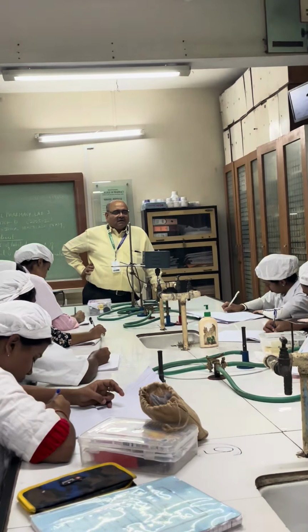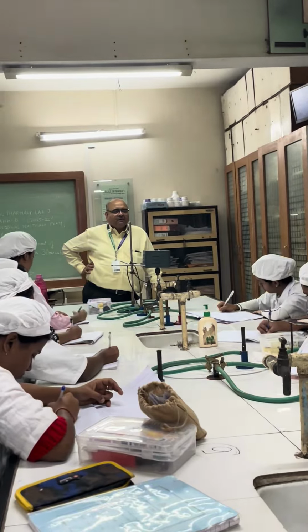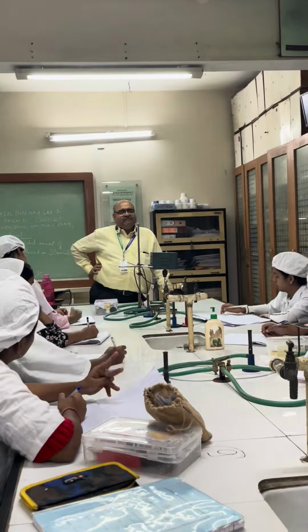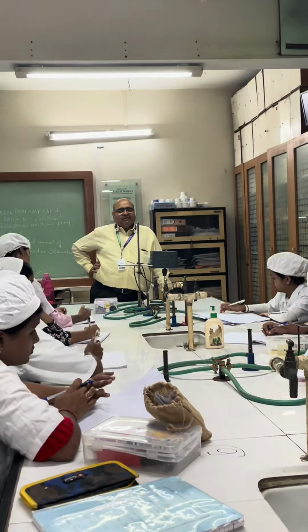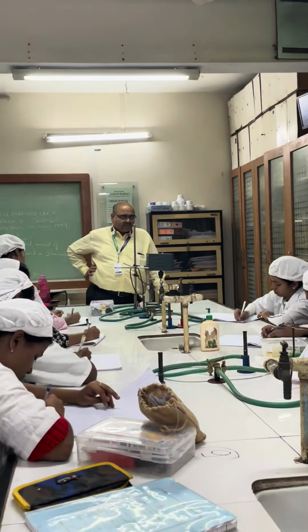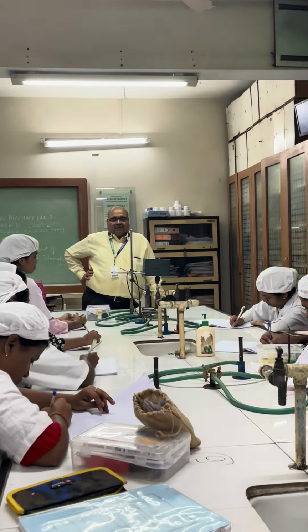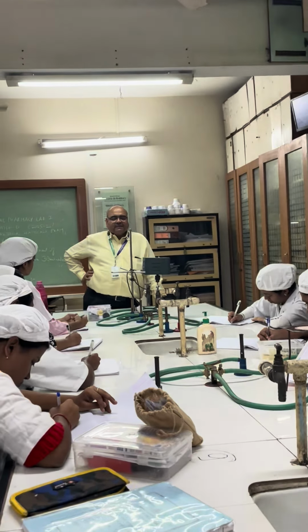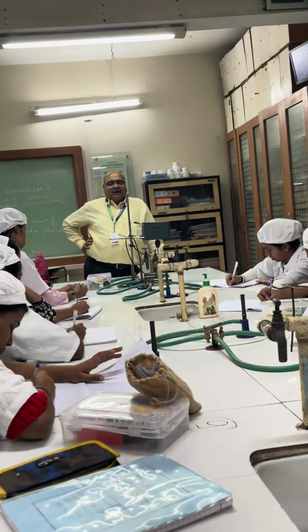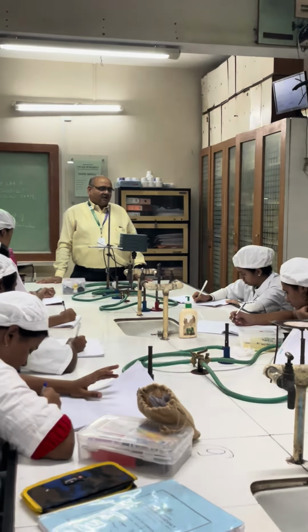This confirmed test will be carried out using BGLB medium and eosin methylene blue agar, EMB agar medium. Using these media, the test will be performed, and the results of the test you will get after 48 hours of incubation.